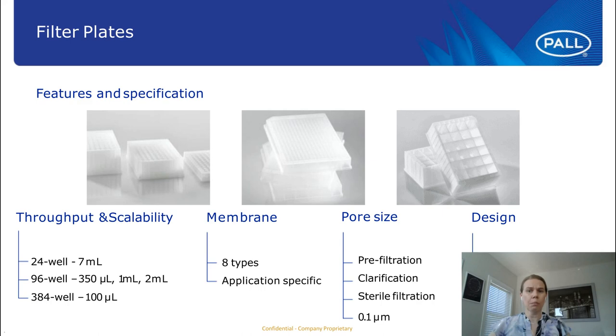Now, most of the filter plates are designed for a specific application, and that's why the membrane and pore size would be specific for that particular application. However, we do have some general and universal filters that I will cover later on. And with regard to the design, it's a crucial point, and I'll talk a little bit about it in a few moments, especially if you're performing high throughput analysis using automated or robotic systems.